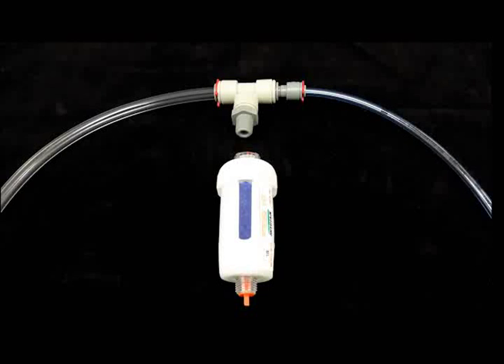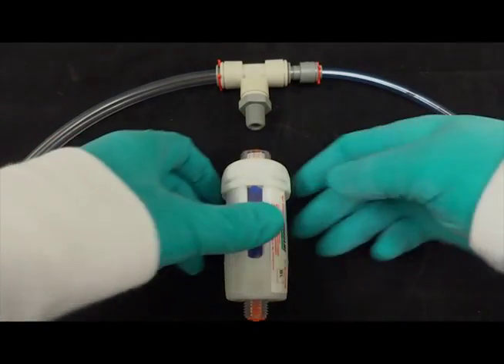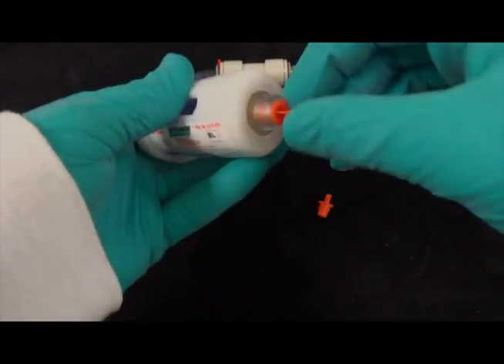To connect your drying filter to your FX5000 FlexLink, first remove the orange plugs at the top and at the bottom of the drying filter.